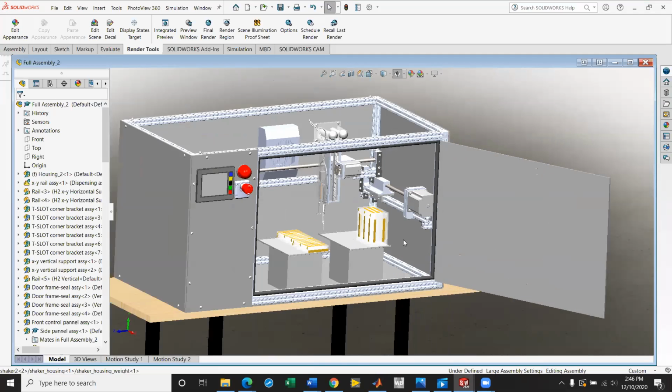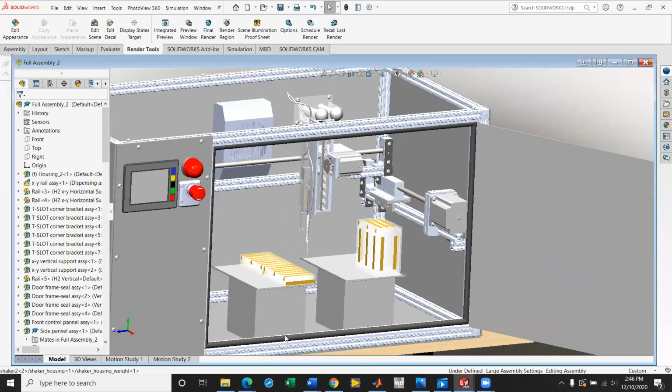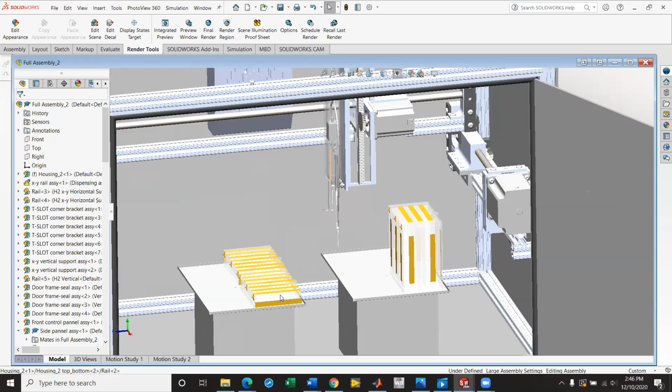So I guess we can start with fluid handling because it's the main thing. We have our fluid handler here, mounted on the gantry, as we said, and it can actuate around to the plates that are on the shakers. These plates are boxes that hold any standard size well plates from 6 all the way up to 384. And then these boxes are made to hold the conical tubes, 15 milliliter and 50 milliliter, interchangeably.